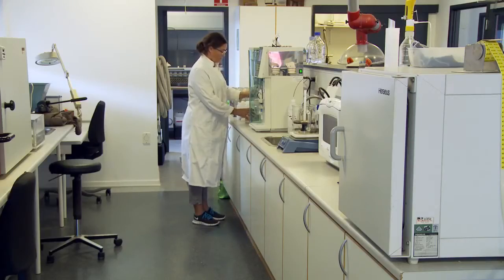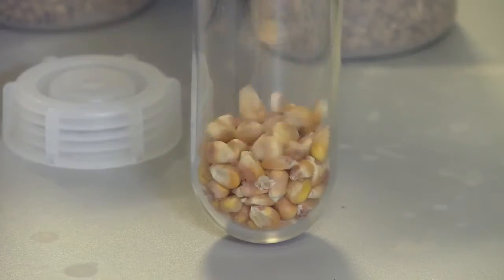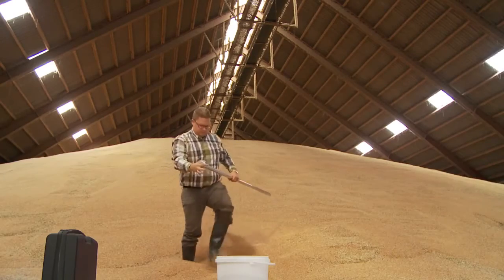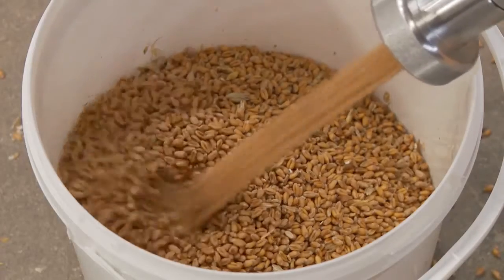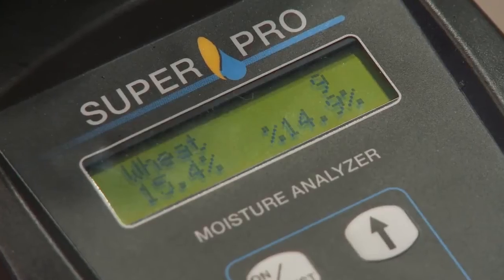This Danish high-technology moisture analyzer gives you the market's safest measurement of water content in crops and seeds. Integrated automatic temperature compensation, grinding and compression of the sample gives a more reliable result every time.